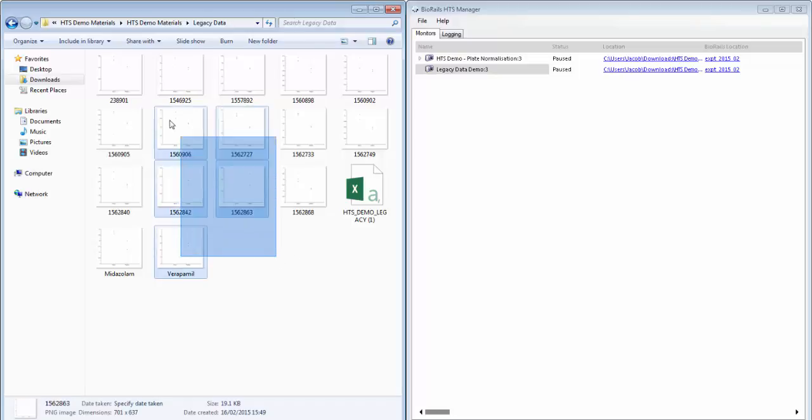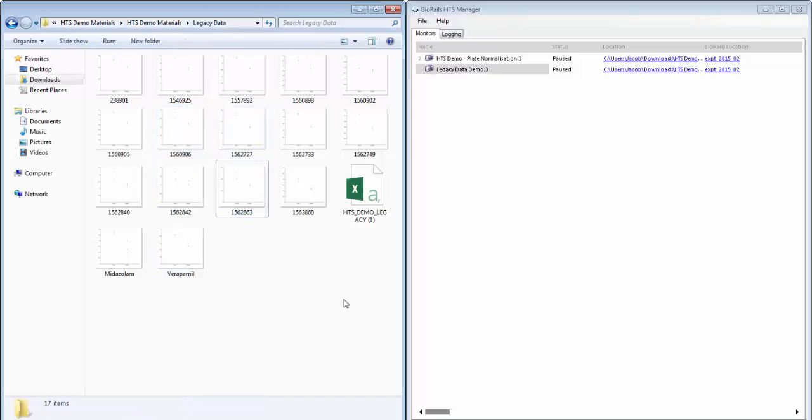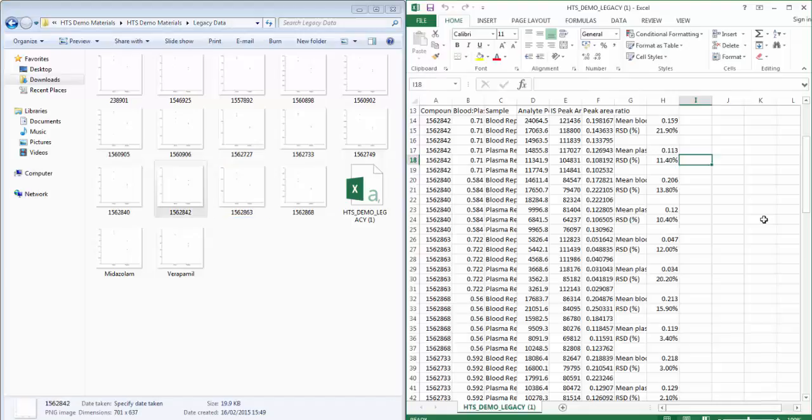However, we also have a set of charts which were created in the study for each compound in our data file and it's important that we preserve the links from the results for the compounds to their specific chart.